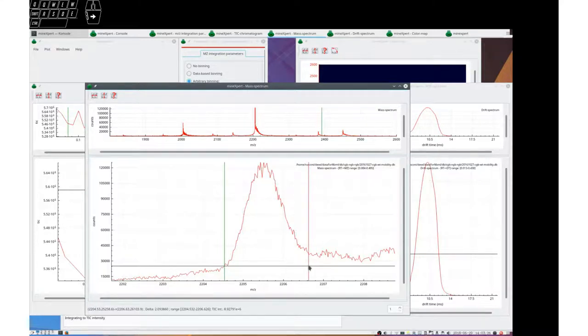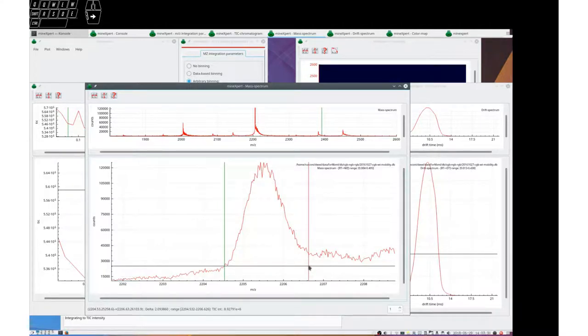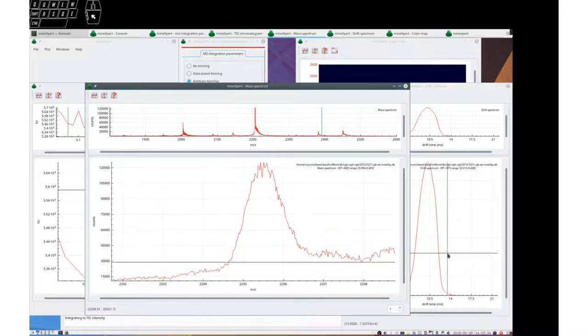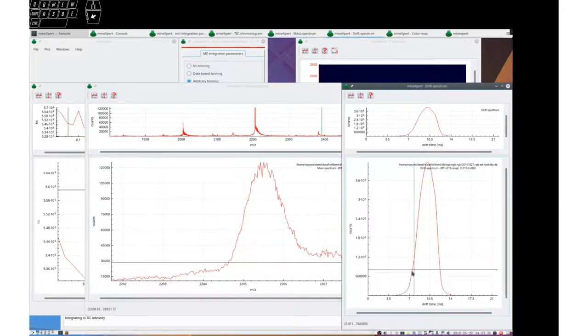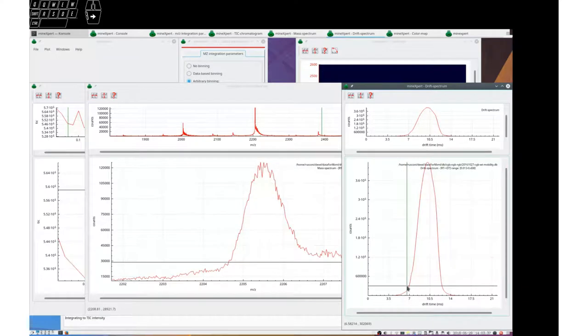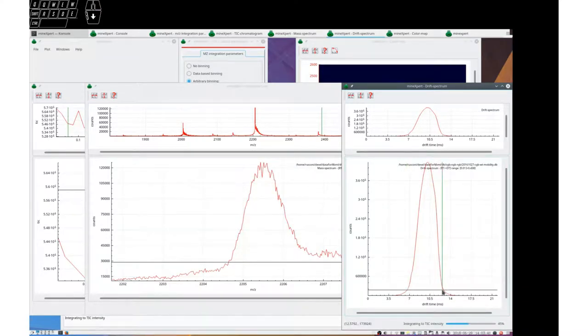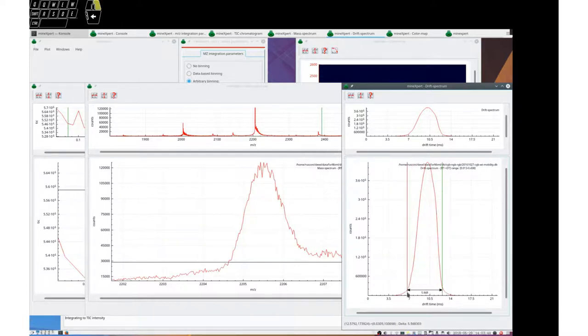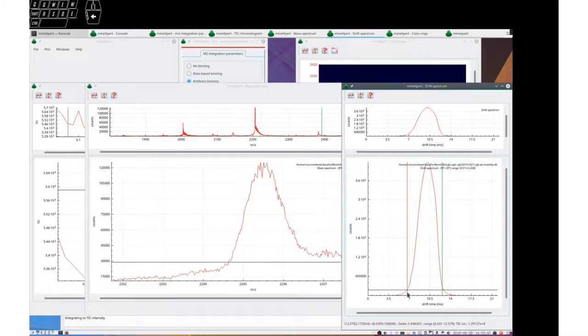And as we can see, the value is displayed, 8.9 exponent 6. Exactly same thing here. Let's look at the intensity of the whole drift peak. There we are.